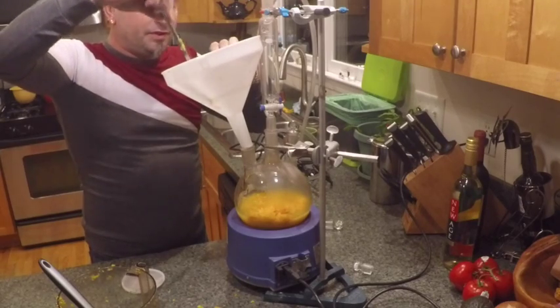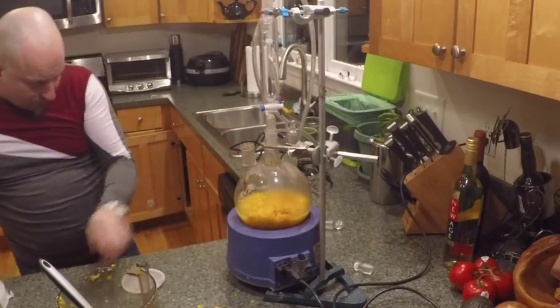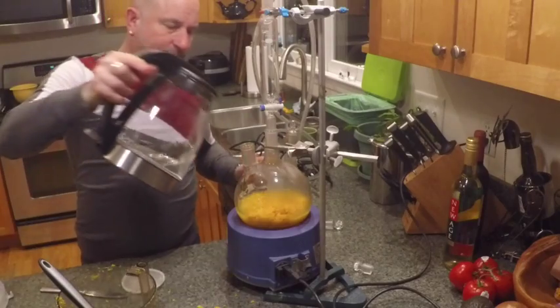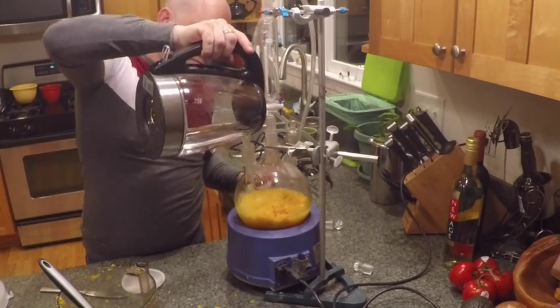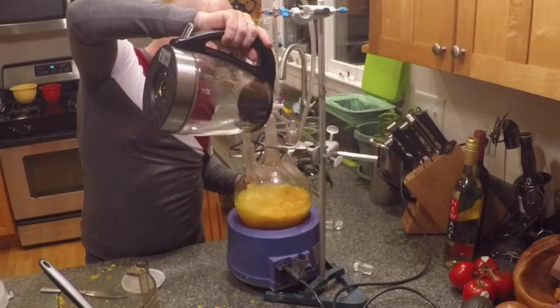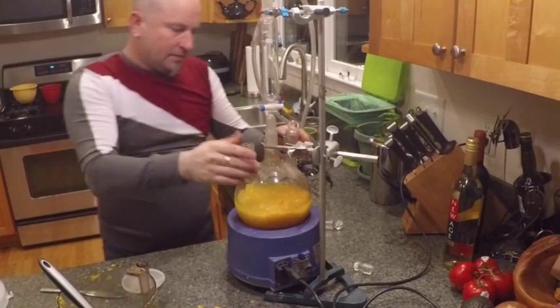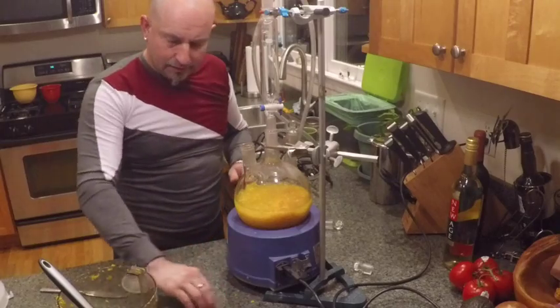We want enough water to keep it mobile down there, so let's add a bit more. That's probably enough. Let's turn the heating mantle on.